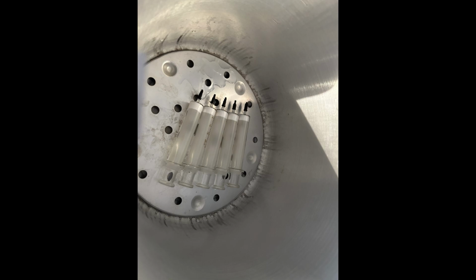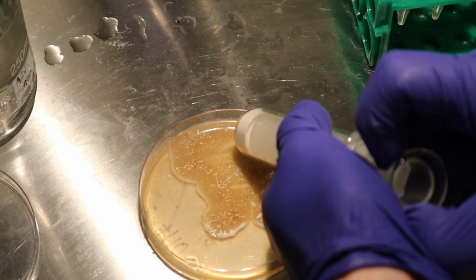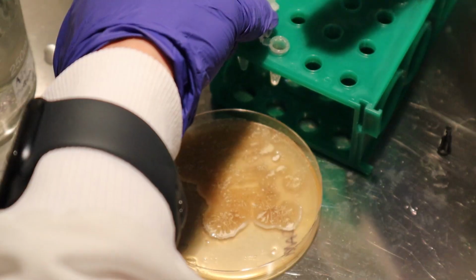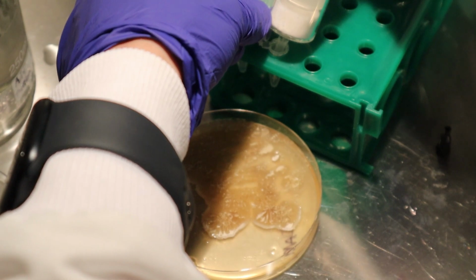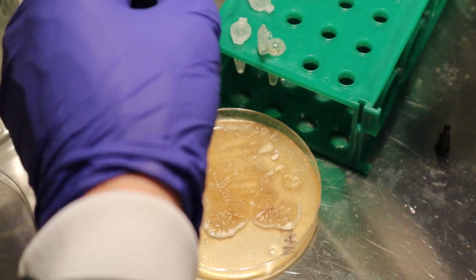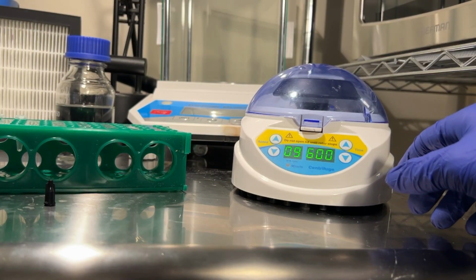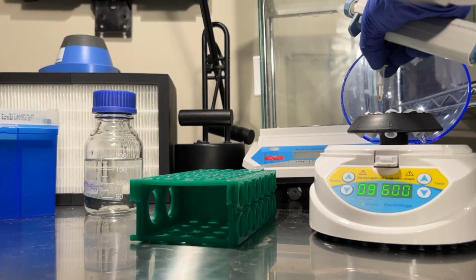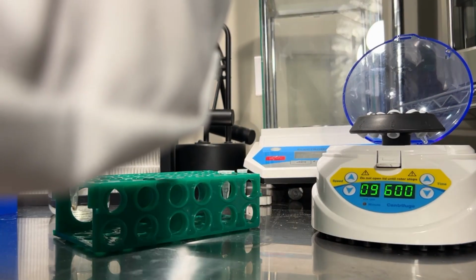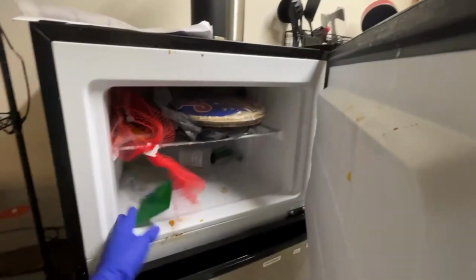I had no idea what this was supposed to look like. Anyway, I couldn't suck out anything, and it got stuck in the tip, and I desperately tried to pipette it into the centrifuge tube, which clearly didn't filter out anything as it never passed through the cotton. But anyway, it's now in a centrifuge tube, which I was then supposed to centrifuge for 10 minutes at 9,000 RPM and squeeze out all the spores into a pellet at the bottom so I could change out the liquid above them for a sterile 40% glycerol solution to freeze and store it properly.